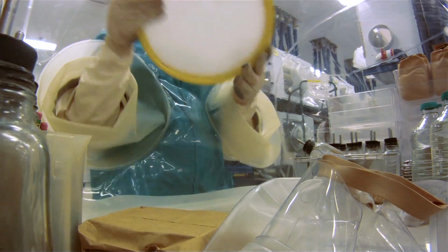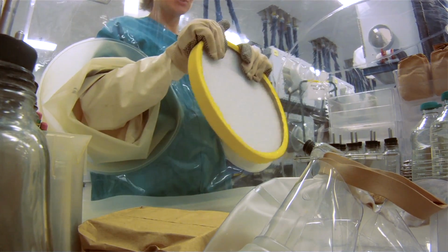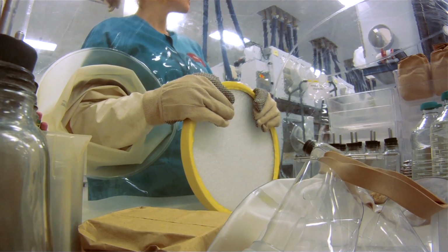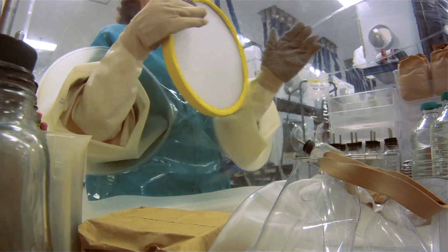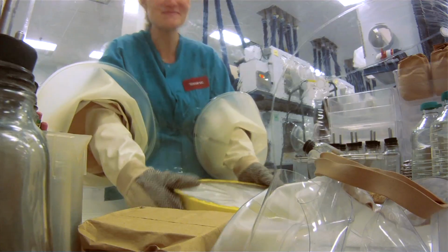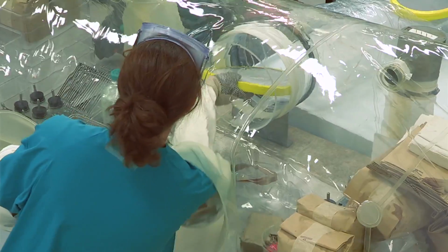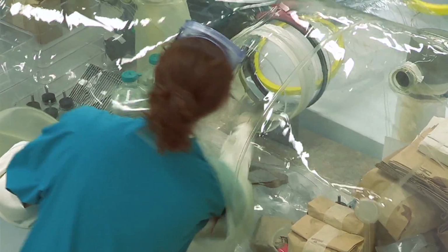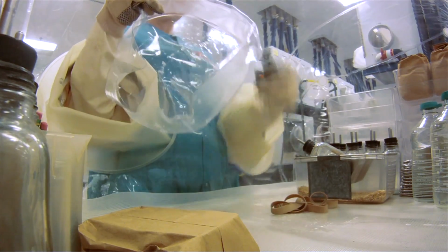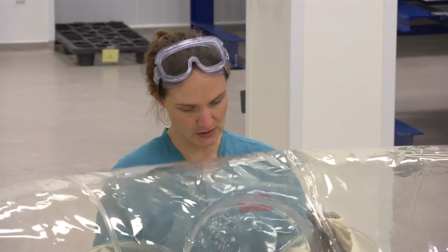And now when we're packing these, this Mylar disc goes back out, and then we retape to make sure it doesn't move. It's usually nine times around to make sure that the disc doesn't move. We certainly tape them into place. So then we'll just send this right back out. And then we can check our inside cap over again, make sure we don't find any holes.